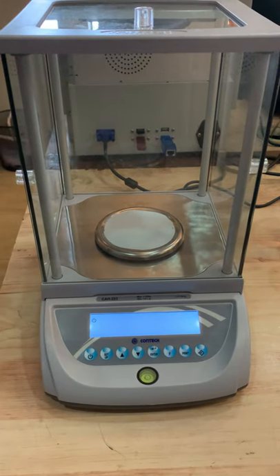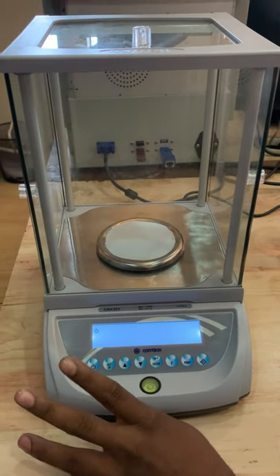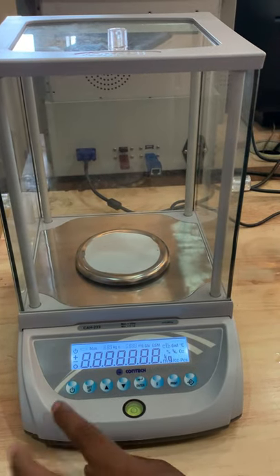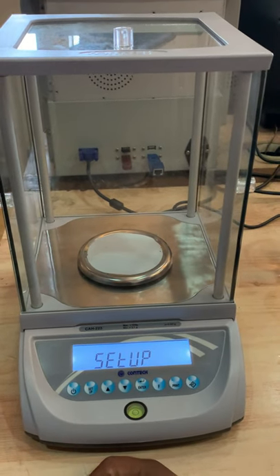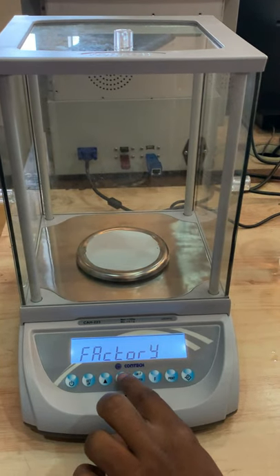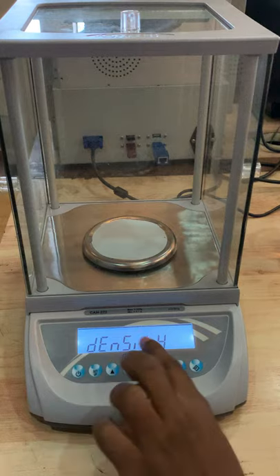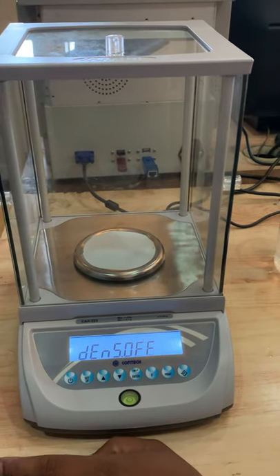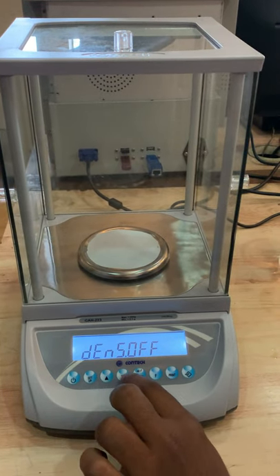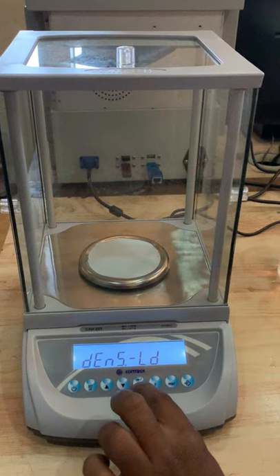Switch on the machine and power supply. In parameter setup, press the setup key — setup will come. Wait for factory mode. Press the down arrow key until density comes up on the display. Press enter. Now density is off. Press the down arrow and up arrow to select the measurement type. LD means liquid density. Press enter.